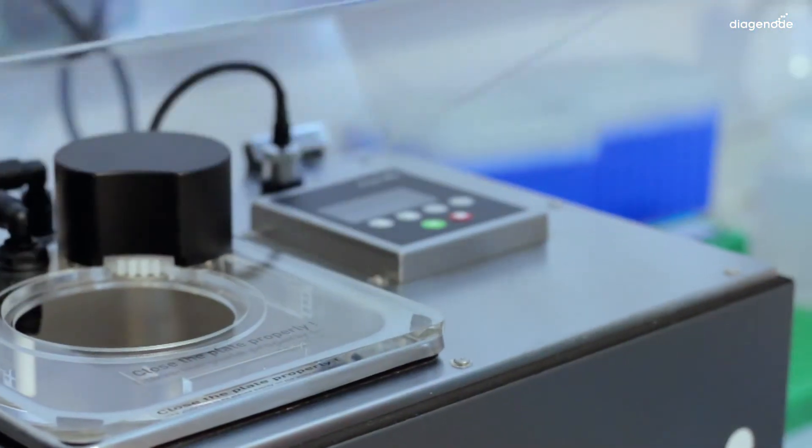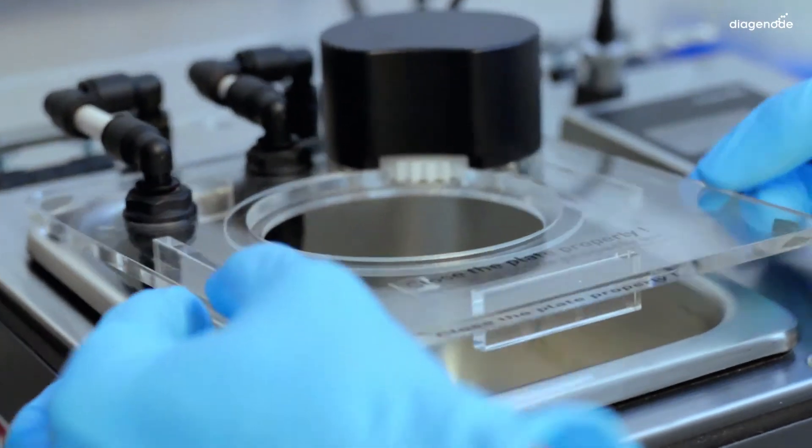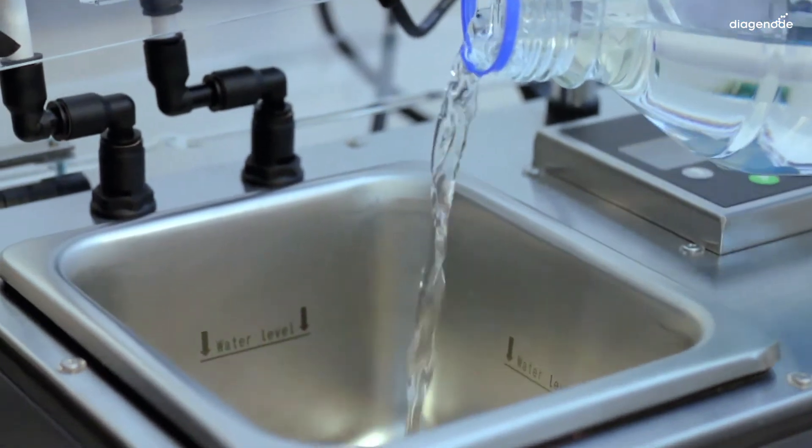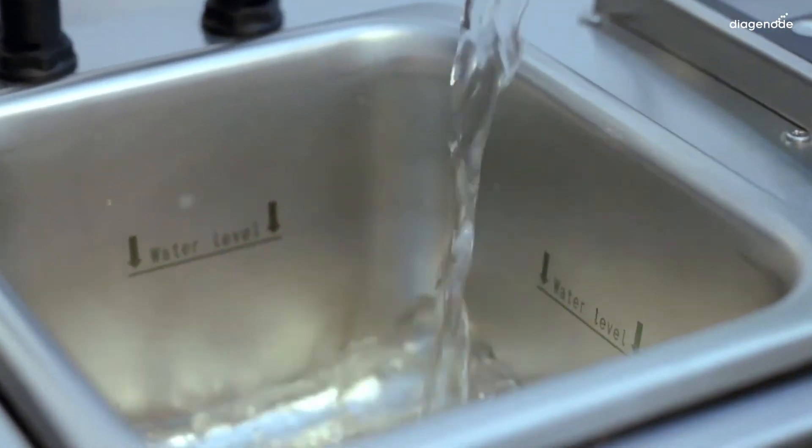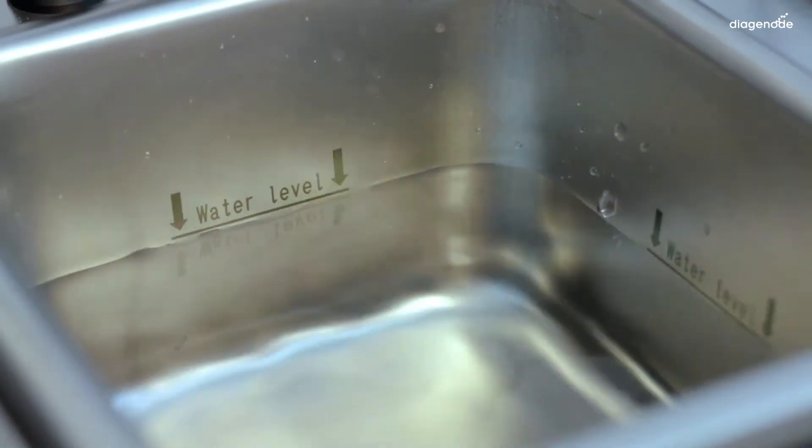If you put too much, the extra water will be drained automatically. To see how to do the draining manually, check the good practices video. Then fill the sonication bath with about 700 ml of distilled water until the level reaches the line.